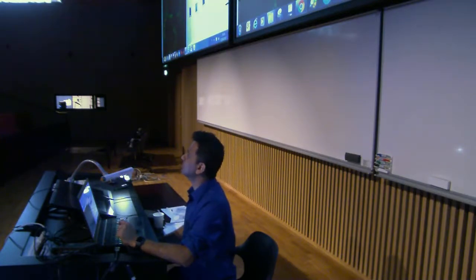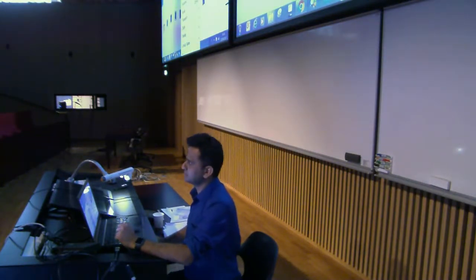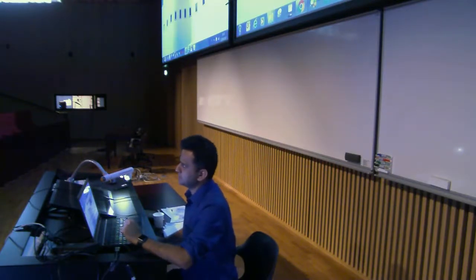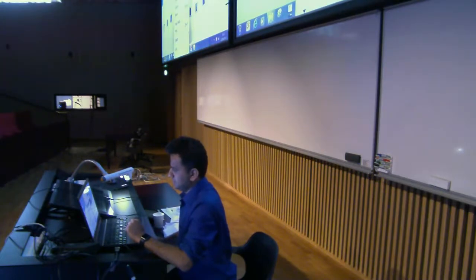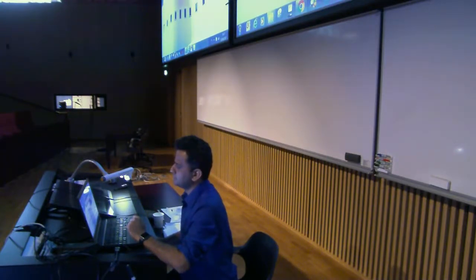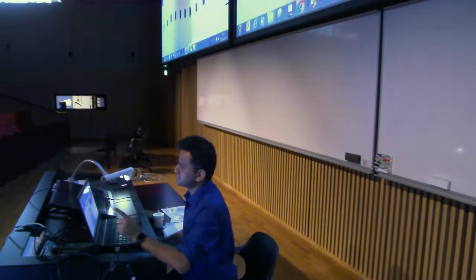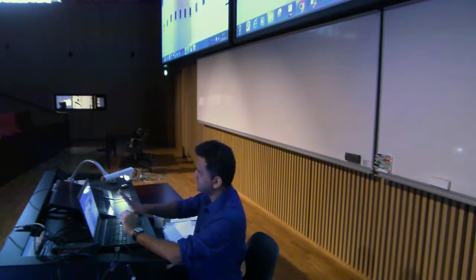Alex, what did you say? It might be that your scale bar is overlay and it got lost. Yeah, but I converted to RGB, so it should work, because when you say RGB, it should be a part of that image. Yeah. Okay. Or maybe let's try that, because you may be right. Because it's a part of overlay, it would not come up. Okay. So for that, what I would do, go to same thing. Yeah, because there was a question about this one, and that's why. Normally you are always supposed to switch off the overlay, because that should be a part of your image, and then it would come.